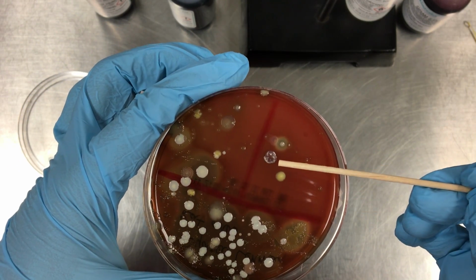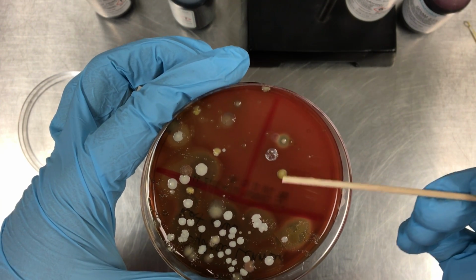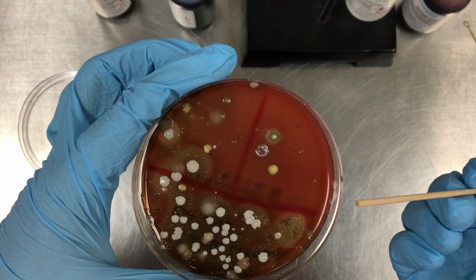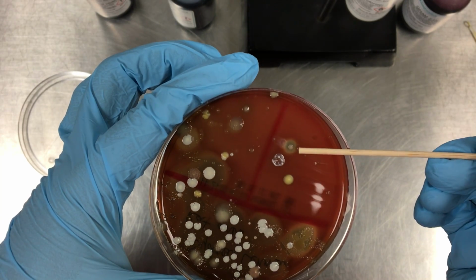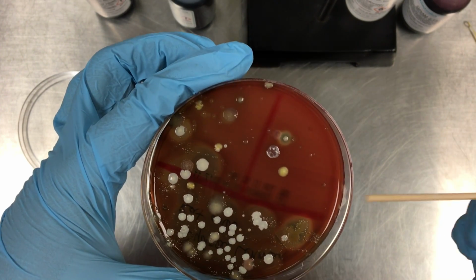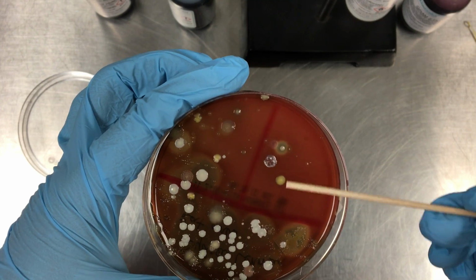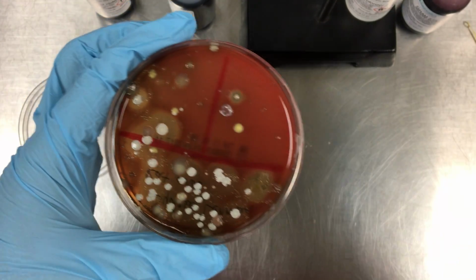So this bacteria in particular has no zone around it, neither does this creamy yellow have a zone around it either, so both of these bacteria are demonstrating gamma hemolysis, whereas this bacteria colony here has a clear zone around it, which would be beta hemolysis. So just make a note of that on your lab report. Whichever colony you sample, you need to make note of what type of hemolysis was displayed on your Petri dish.